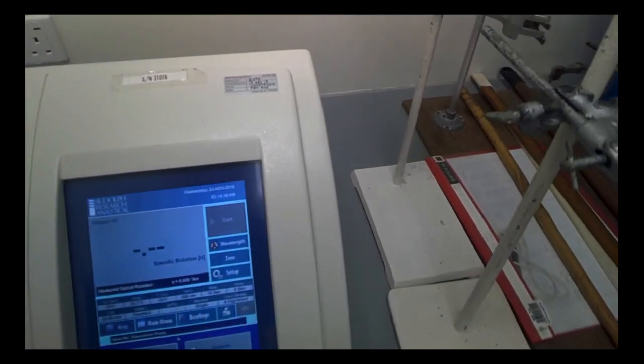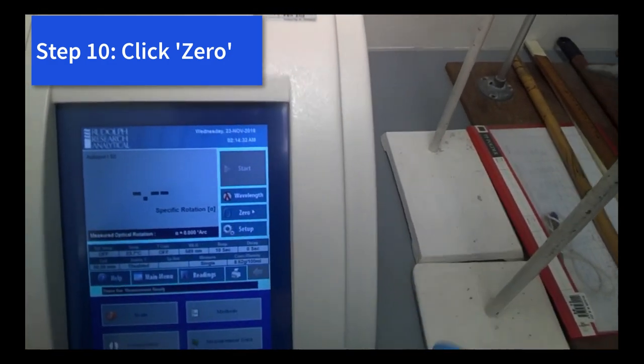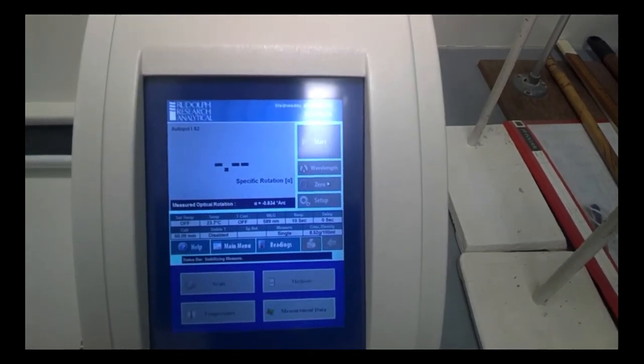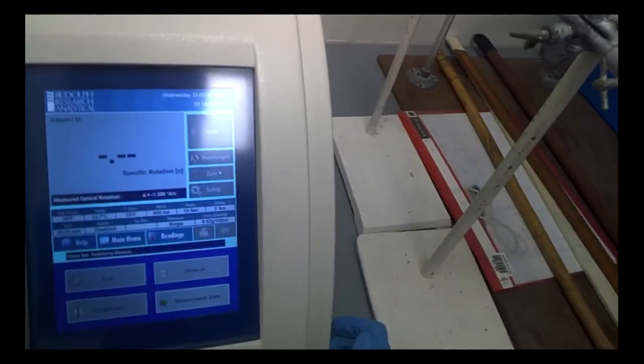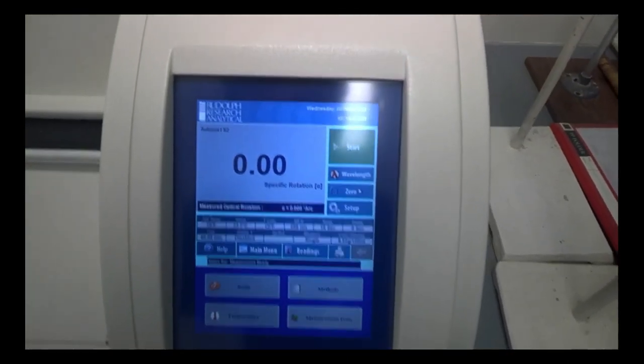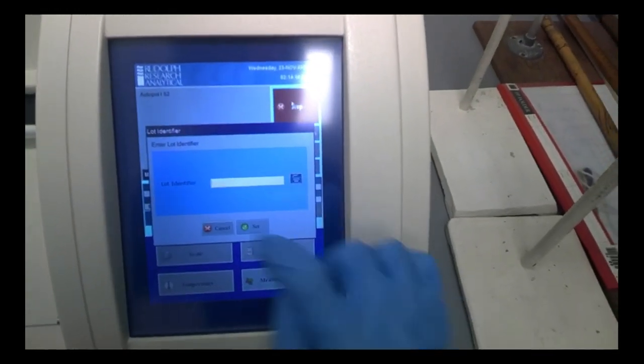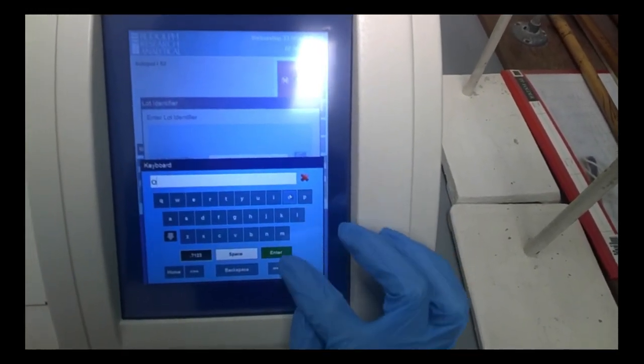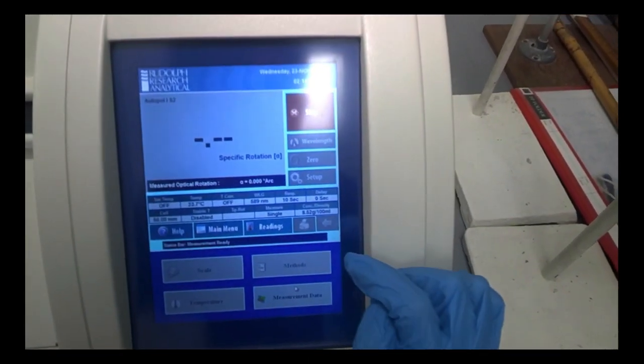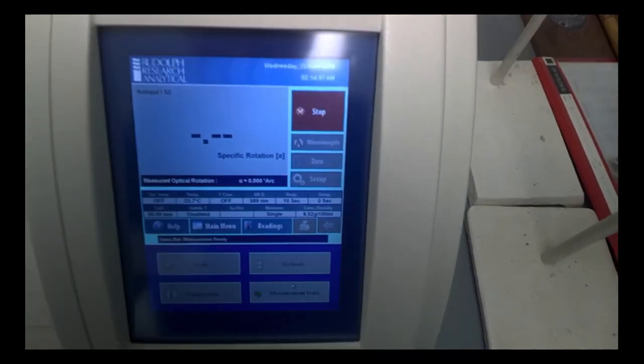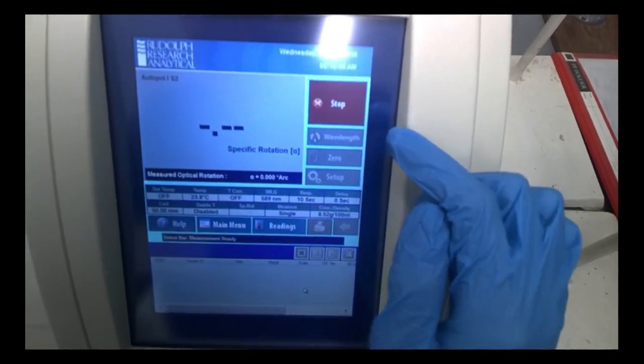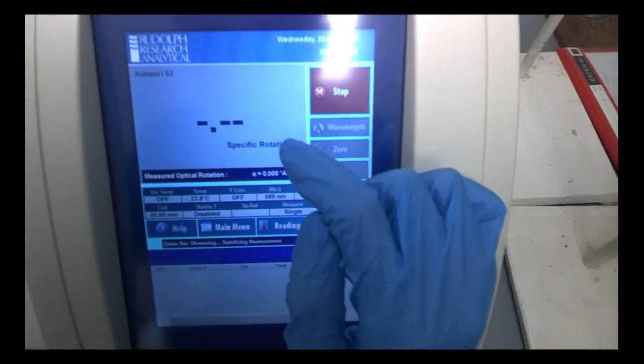So right now we can do a scan. First, place it into the sample holder. Close. All right, so of course we have to do zeroing. Remember, since it's all ethanol and ethanol does not have any chiral center, we should expect the reading to be zero. So let's see what happens. Start. For log identifying, we just key in any initial that represents your sample. Enter. Same thing for sample identifier.